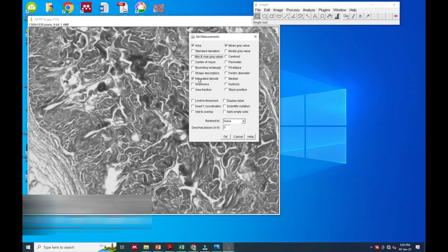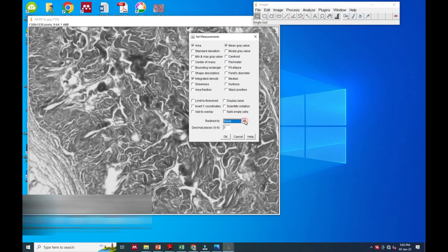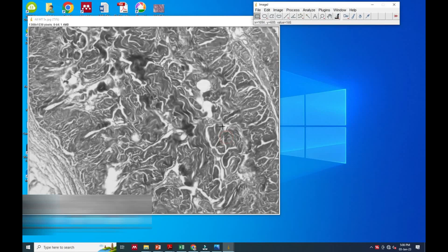We will select - there are lots of options given - we have to select Area and Area Fraction options only, and remaining all unmark. And we will click OK.